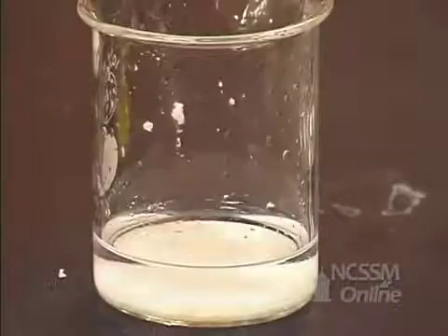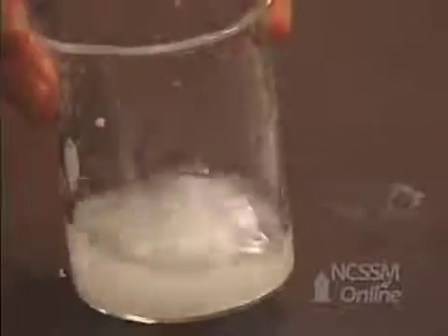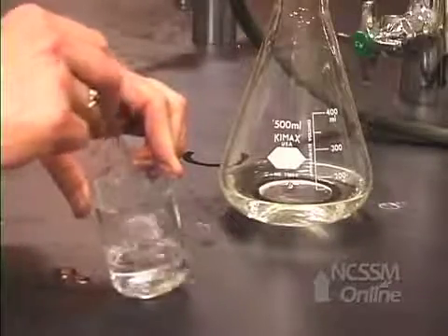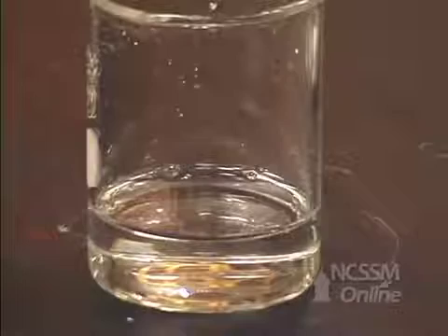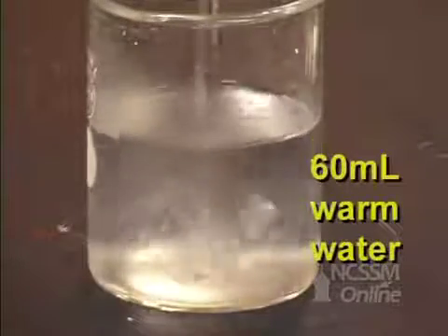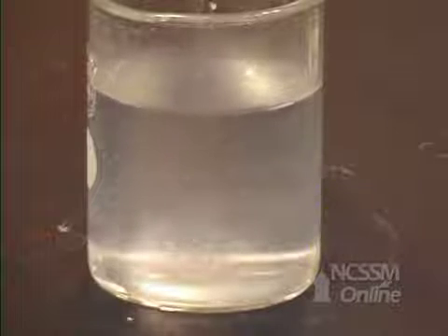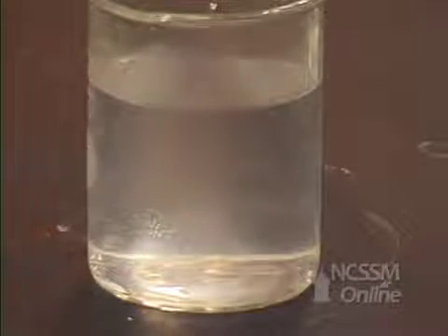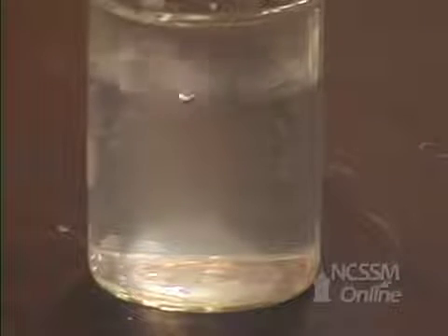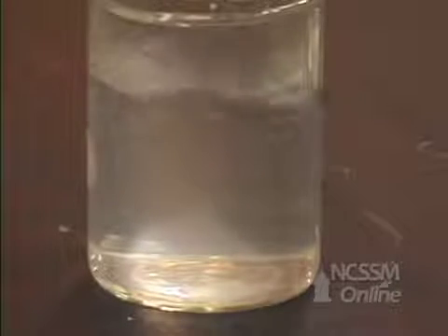Now we want to dissolve our aspirin in the alcohol so that we can recrystallize. Recrystallizing will allow us to get larger crystals of the acetylsalicylic acid. Now we're going to add 60 milliliters of warm water. You see it gets cloudy. There's actually a little bit of crystallization that's occurring. You want to stir that.